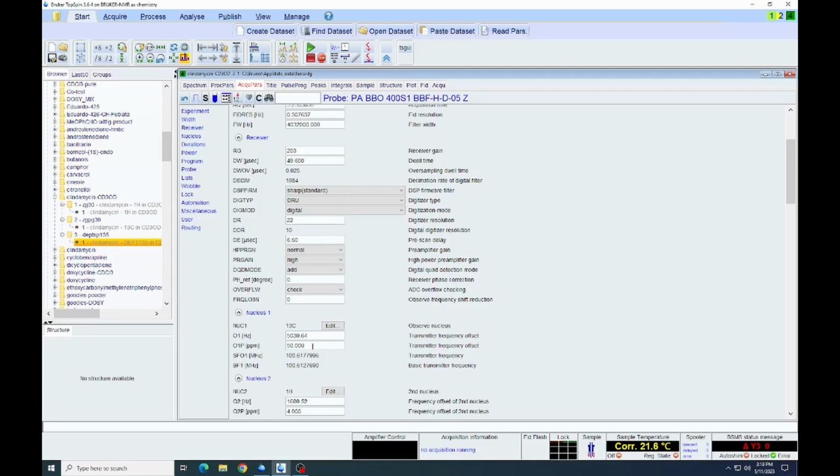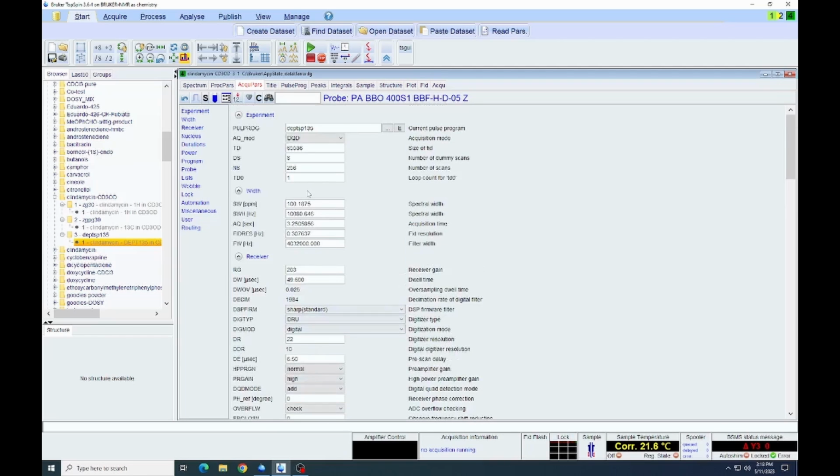The other thing we'll change is the number of scans that we're collecting. Remember, for the carbon, we initially set it to 500. We collected a bit more than half of that. The number of scans in the DEPT can typically run easily half the number that we had in the carbon and get the same sensitivity, or same signal to noise. So we'll go to the Acquire button now. We've already done the lock, tune, and shim, so just ProSol, and then Gain and Go to acquire the spectrum.